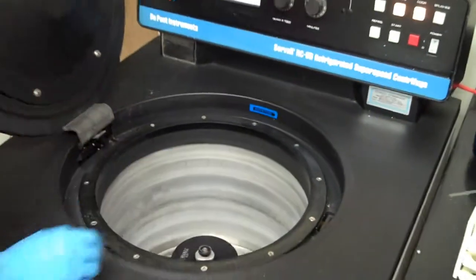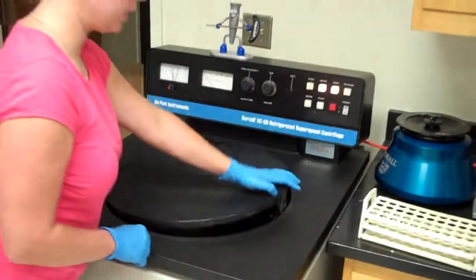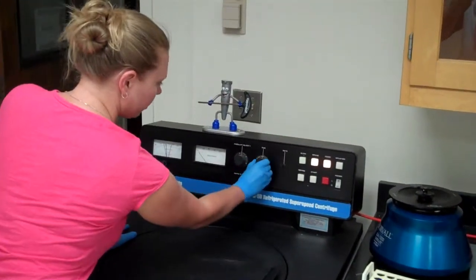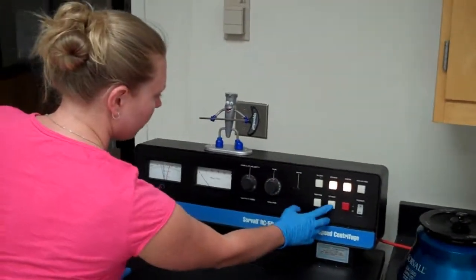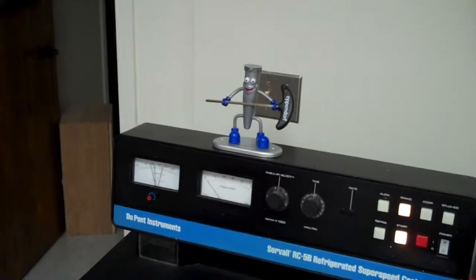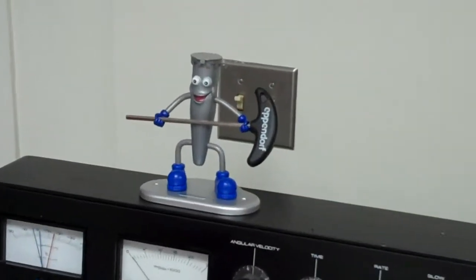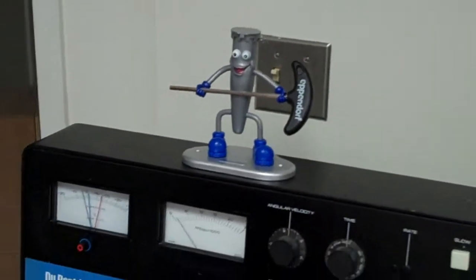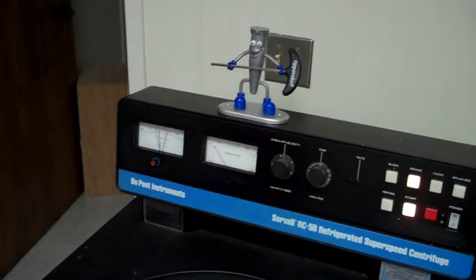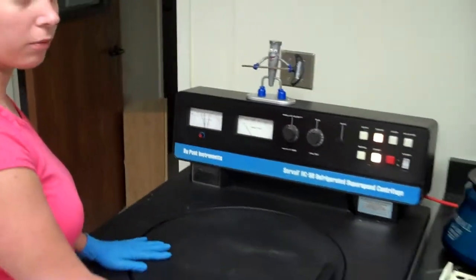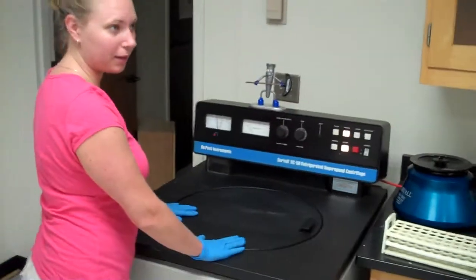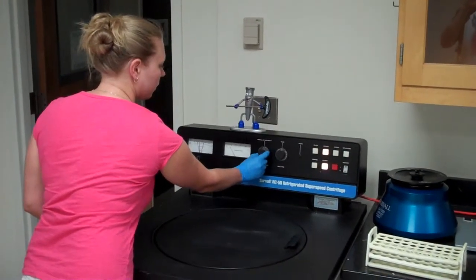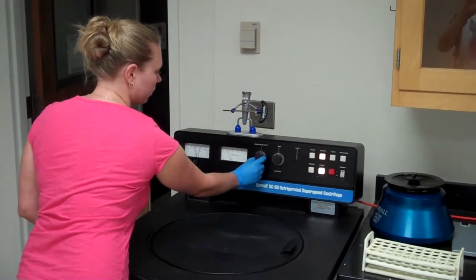Once our rotor is securely in place, close the lid, turn your timer to hold, press start. Always make sure you listen to the centrifuge. If it sounds nice and quiet like this, we know that our rotor is properly balanced. Slowly turn the velocity up to the desired speed.